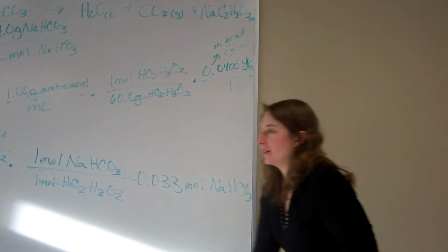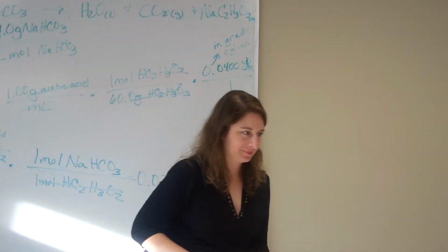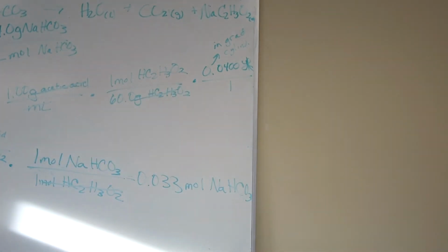Anybody having trouble yet? Have we spotted the problem? You said we need to measure out moles. The scale measures in grams. Aha, there's the problem. Units. If only it had a mole button, we'd be all set. What are we going to do? We know moles, but we need grams. We know that 84.0 grams are in 1 mole.